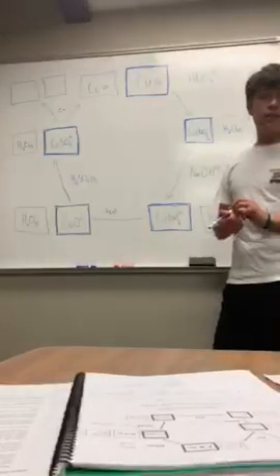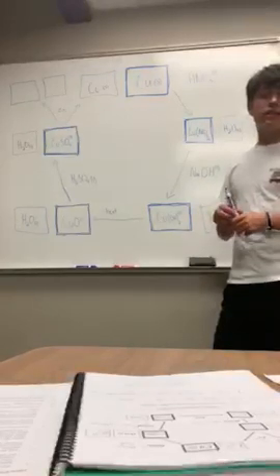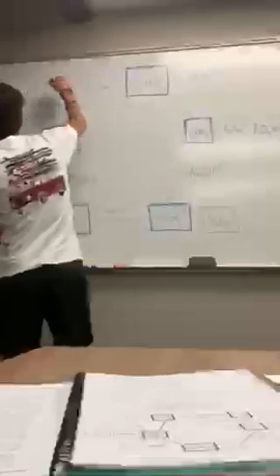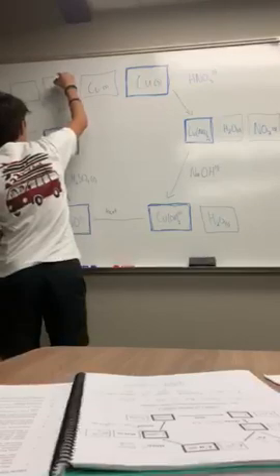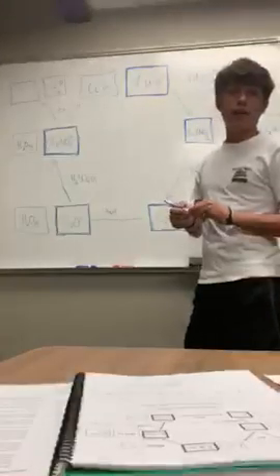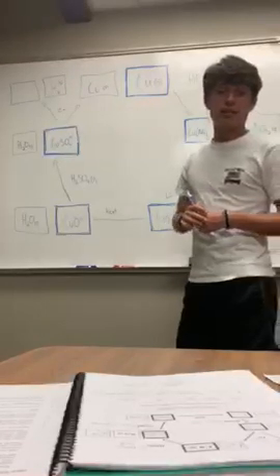The gas that was given off from the fizz and steam is hydrogen. And finally, the liquid that was decanted is zinc sulfate.